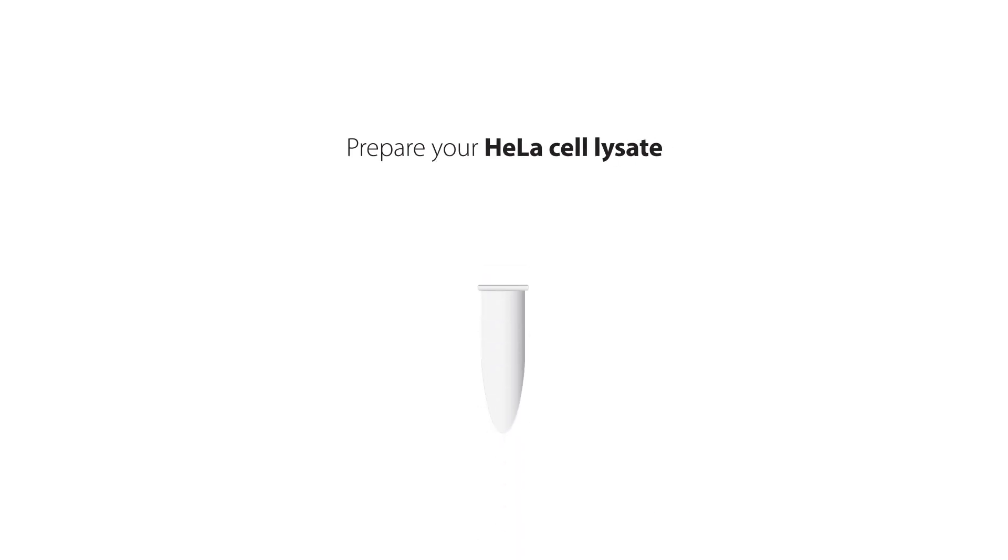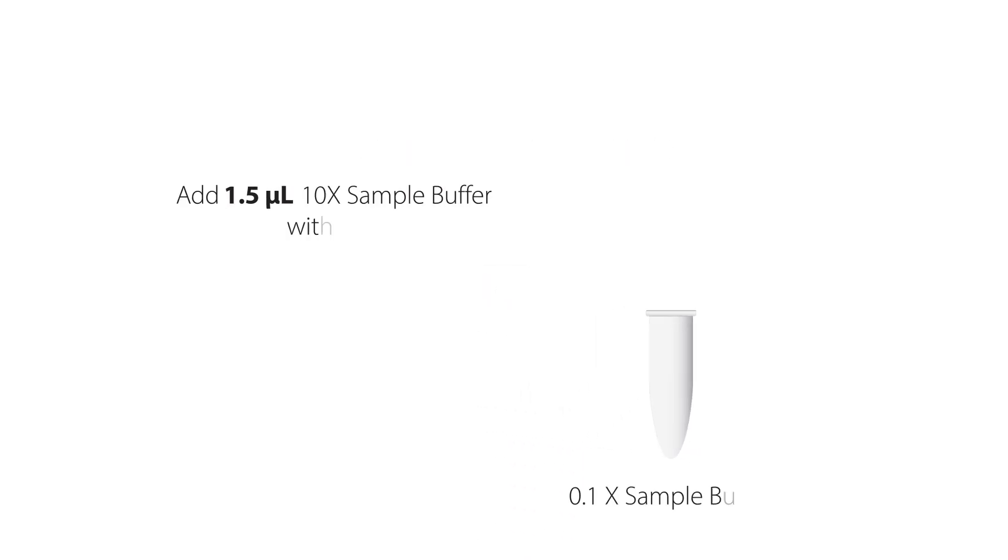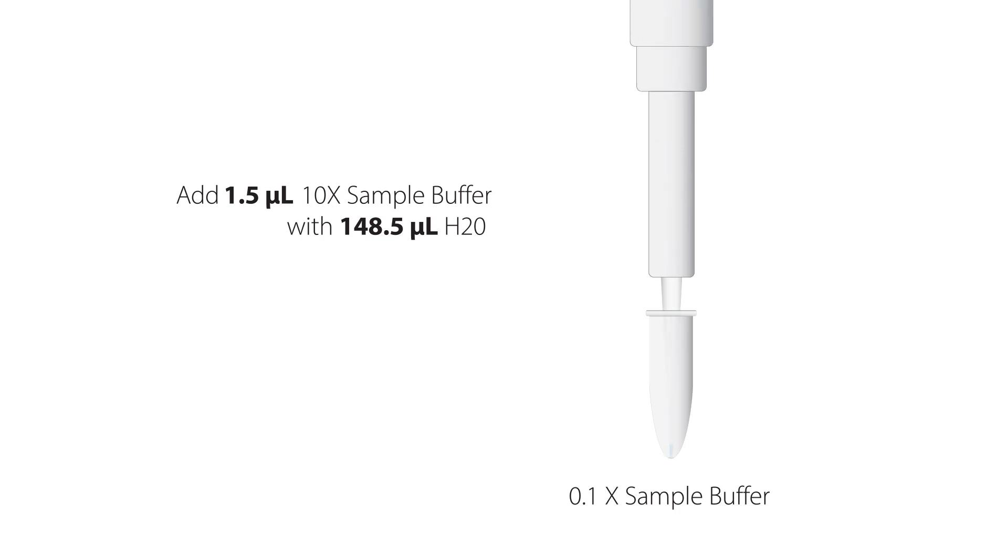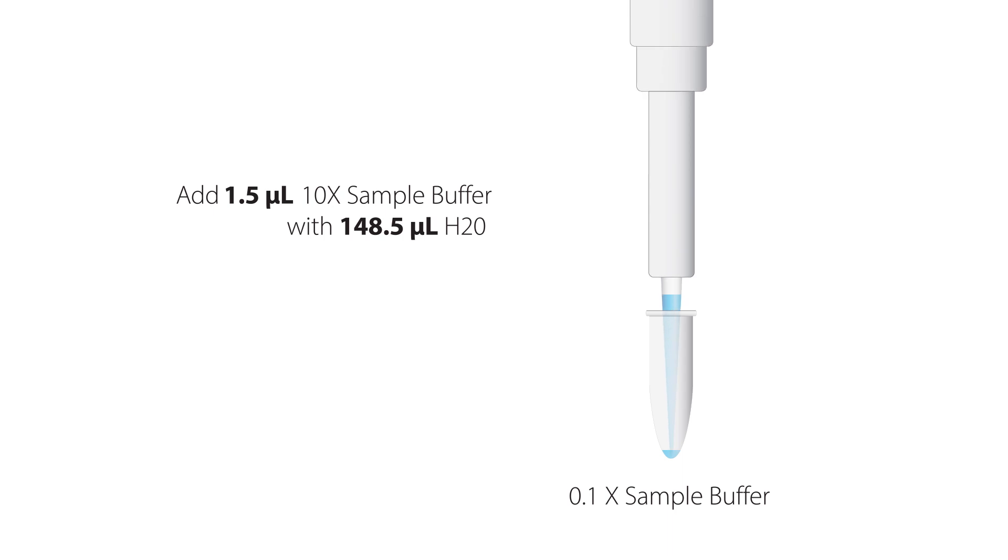Prepare the HeLa cell lysate. Prepare 0.1x sample buffer by adding 1.5 microliters of 10x sample buffer and 148.5 microliters of deionized water. Mix by pipetting up and down.